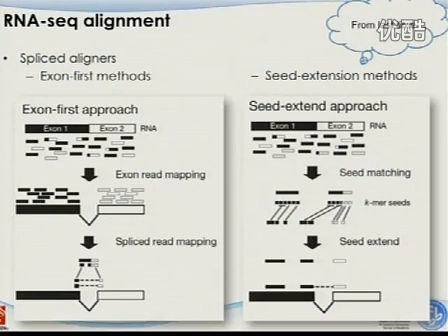Do we have an idea? Nobody? General statistics? Give a guess. Let's say the median value. What's the median value for the nucleotide length of an exon? 1,000 base pair? 100 base pair? It's 127 base pair. And based on that statistic, of course some are shorter, some are much longer, 1/3 of the 50 base pair reads will be on the junctions. And as we are talking about today, those junction reads are really, really important for you to study alternative splicing.